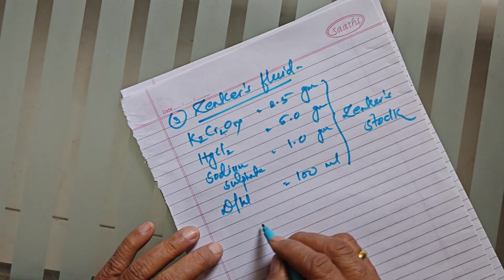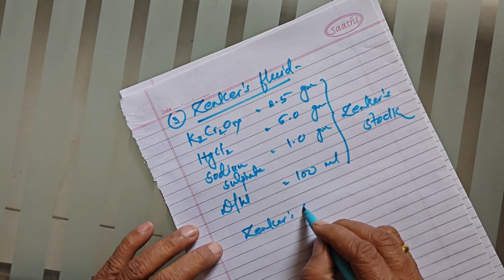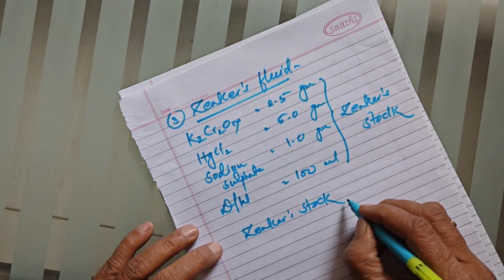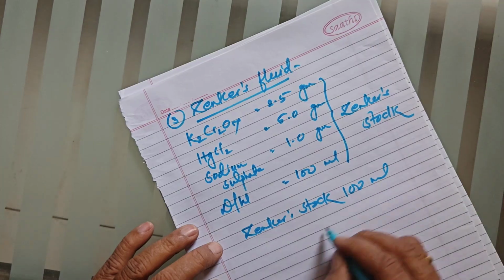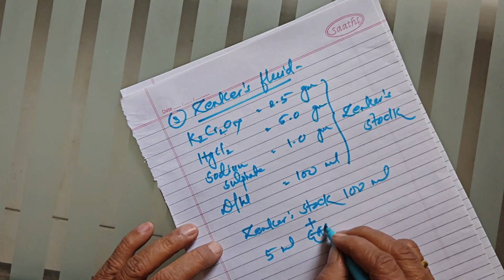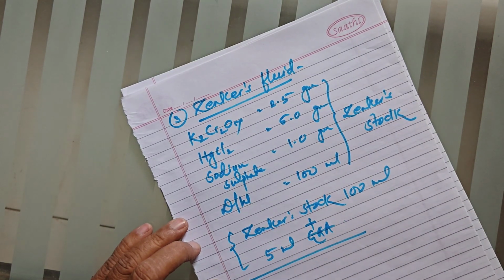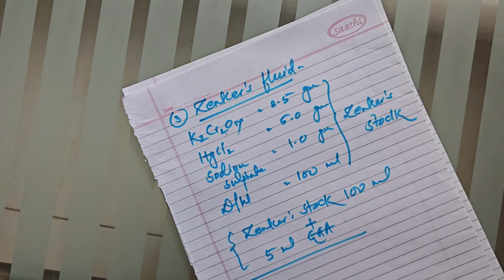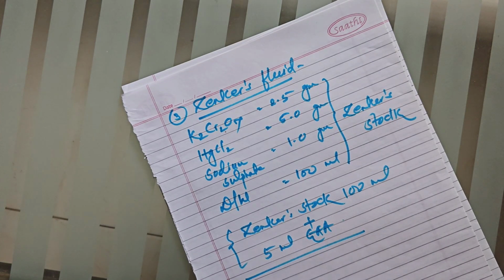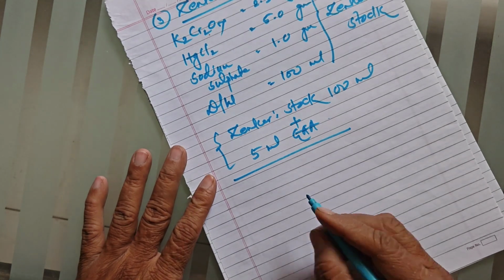Then take 100 ml Zenker stock, in which add 5 ml glacial acetic acid just before use. This solution is called Zenker's fluid. This Zenker's fluid has advantages.